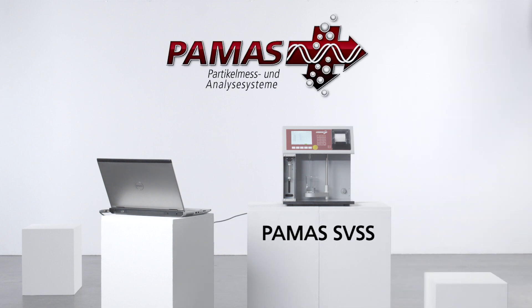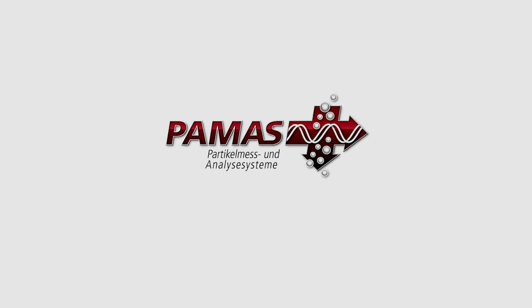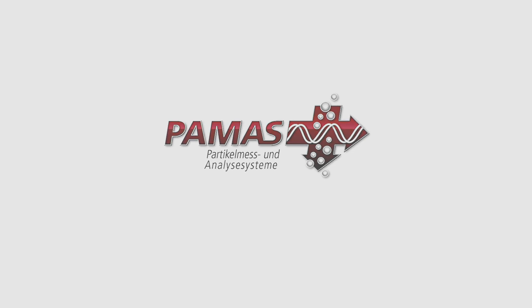The PAMAS SVSS, the versatile particle counter designed for pharmaceutical applications.